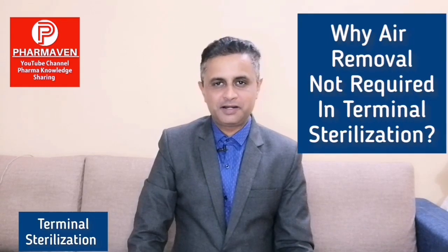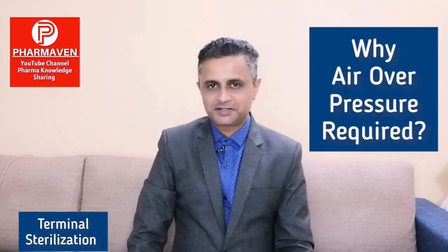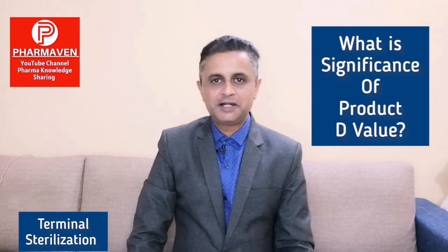So let's understand. I'll be covering 4 important topics in this. First is why air removal is not required in terminal sterilizer, why air overpressure is required in terminal sterilizer, what is the significance of product D value in determining the cycle parameters, and how we can develop a cycle for the terminal sterilizer. So these 4 important factors I will be covering in this video, so please be with me.